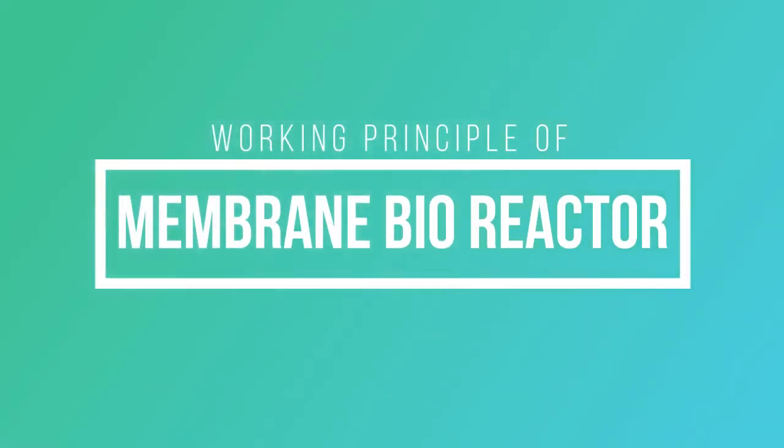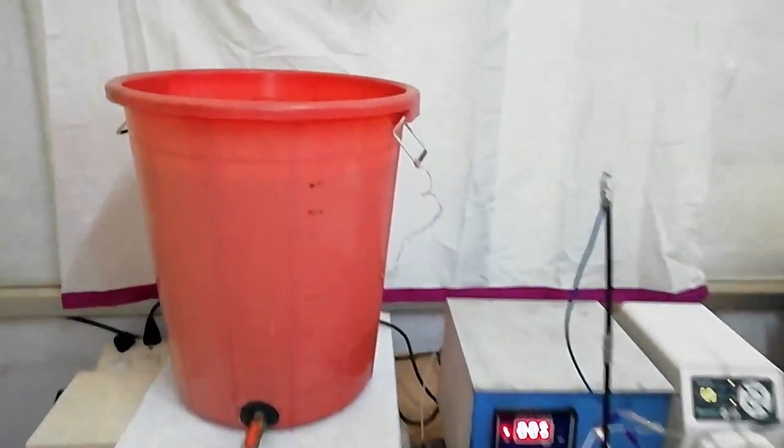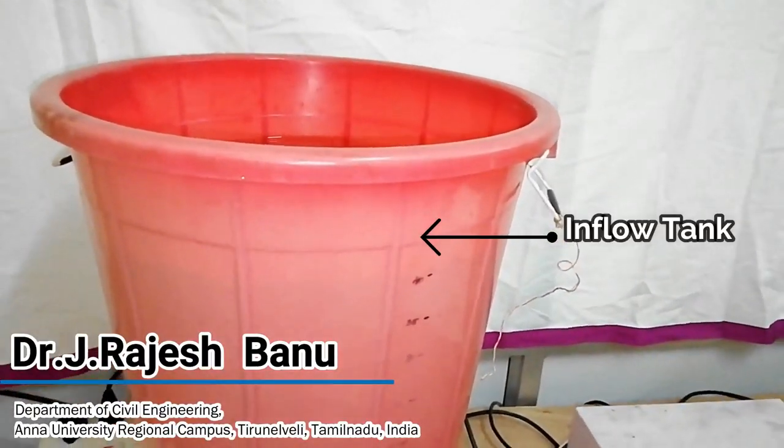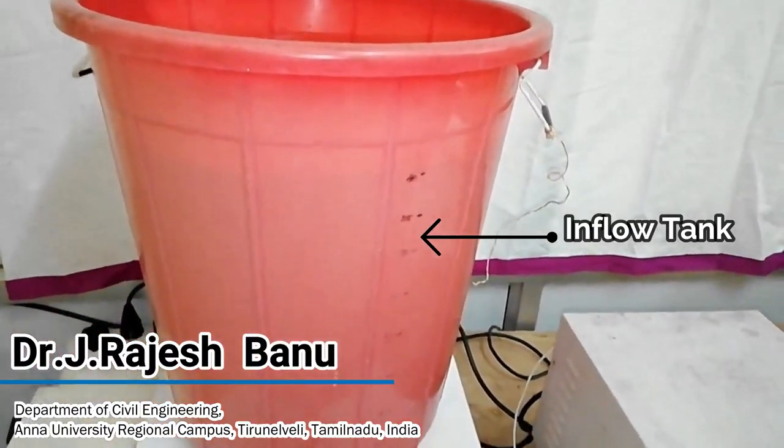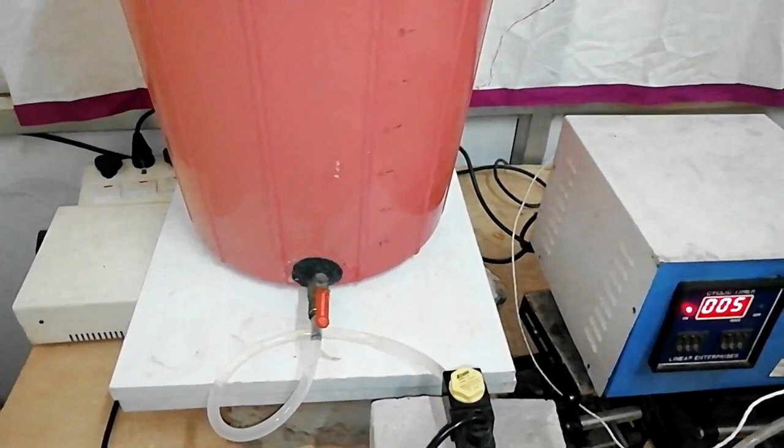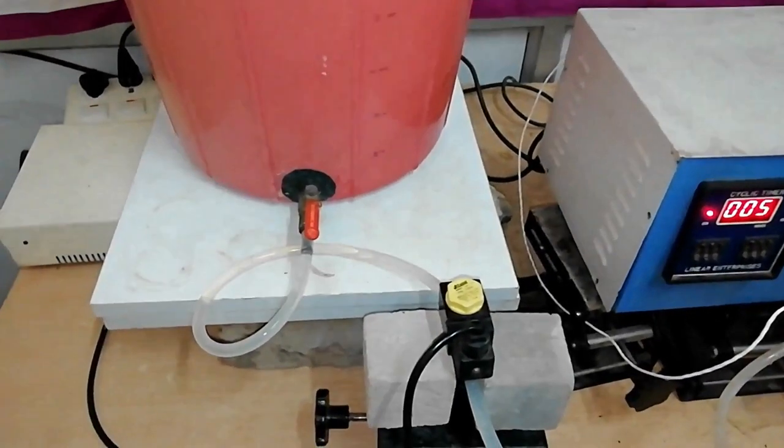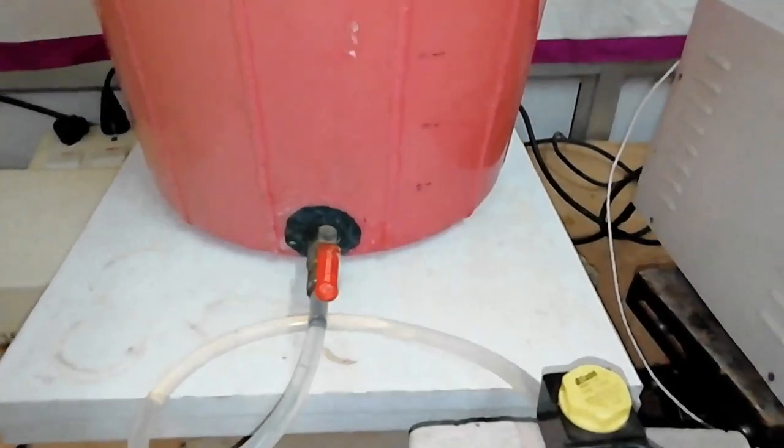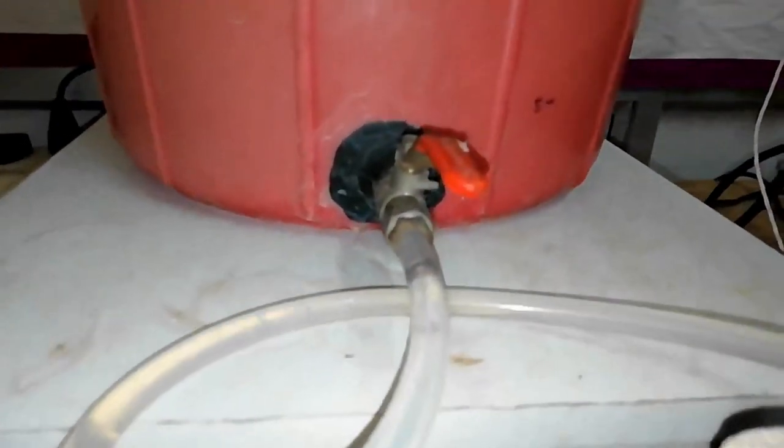In this video, we are going to see about a laboratory-scale MBR used to treat wastewater. This MBR is an aerobic MBR and it is having three important parts. The first one is influent control from the storage tank.